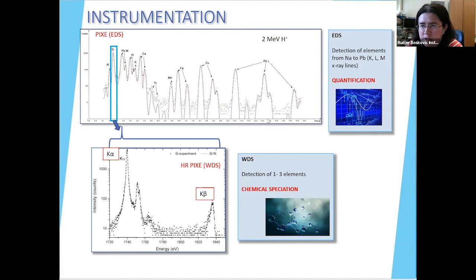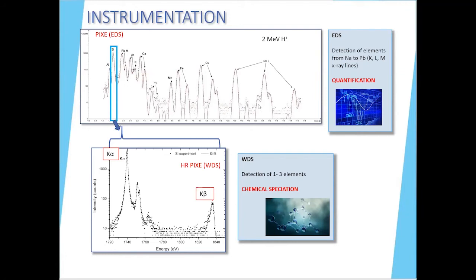For selenium, they're a little bit higher, they have a peak above, I think, around 10 keV maybe. In PIXE spectra, we can see cadmium and selenium, but it depends on the concentration.